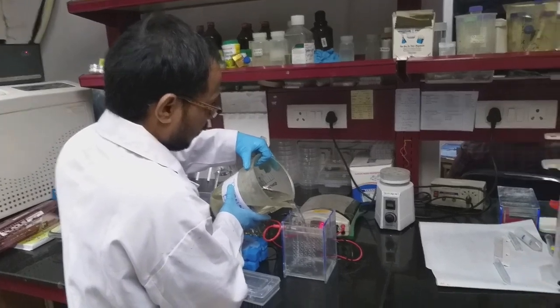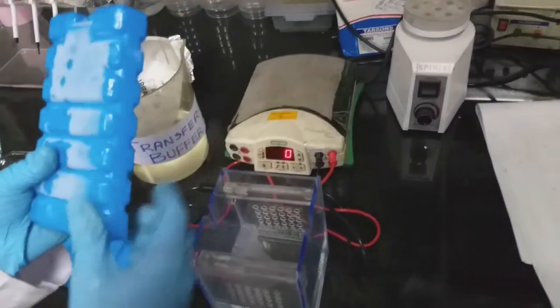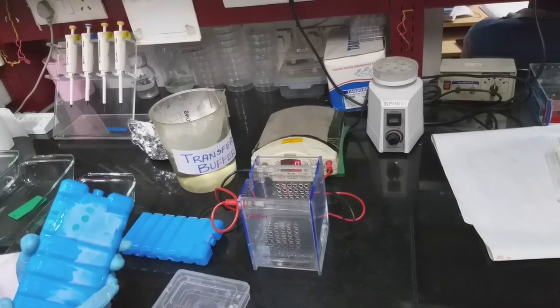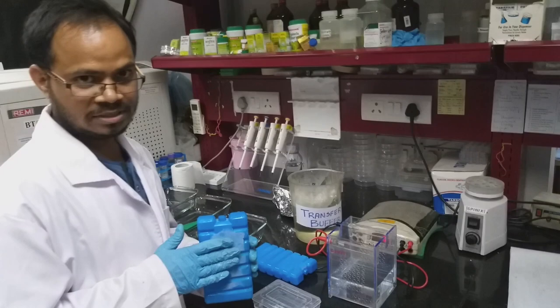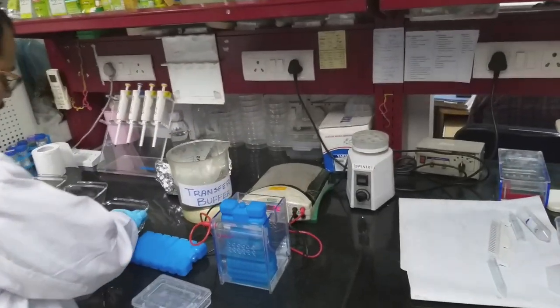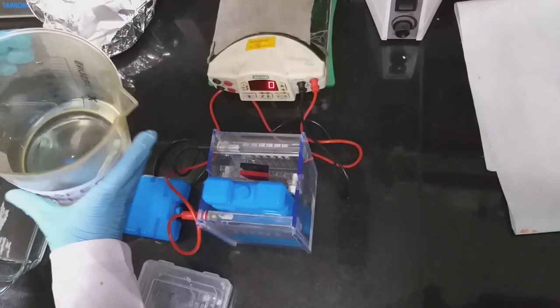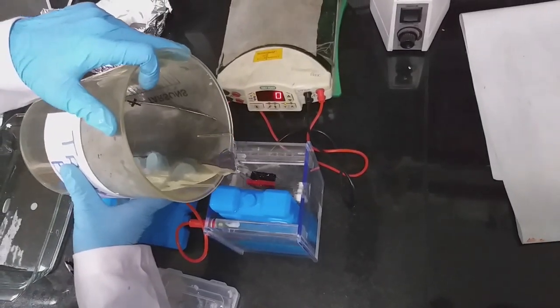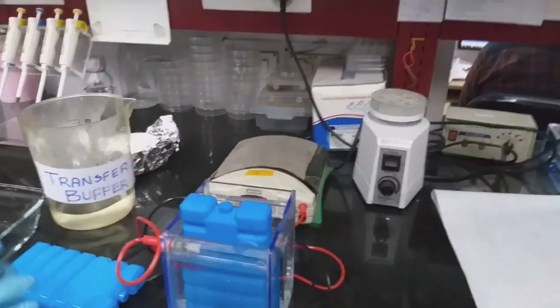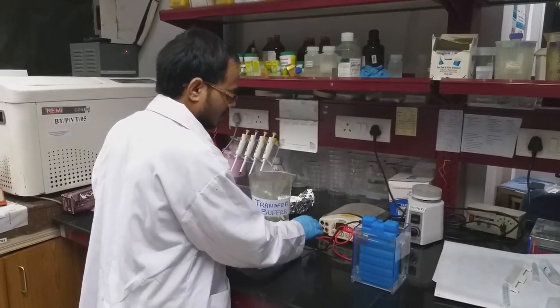Pour sufficient buffer and keep this ice pack also. If the chilling is not sufficient, then there may be heat generation. In order to prevent that, we'll use this ice pack. This will keep the buffer cool till the end of the transfer. Once that is over, you directly take out the cassette. If there is a buffer insufficiency, you can add on top of that. Make sure that the cassette is completely submerged so that the transfer will be proper and there are no air bubbles. Once the setup is over, now you can transfer.